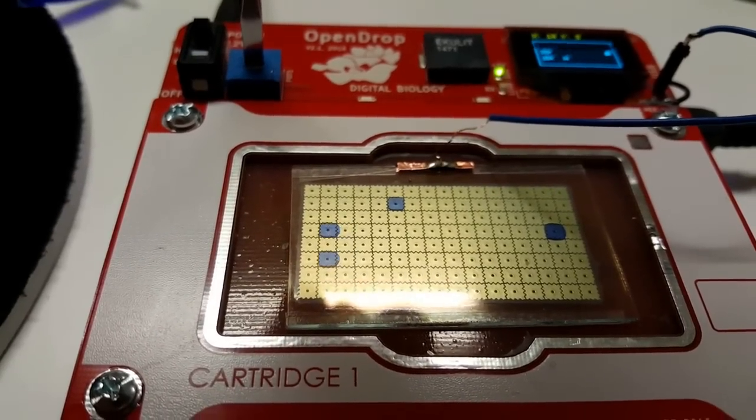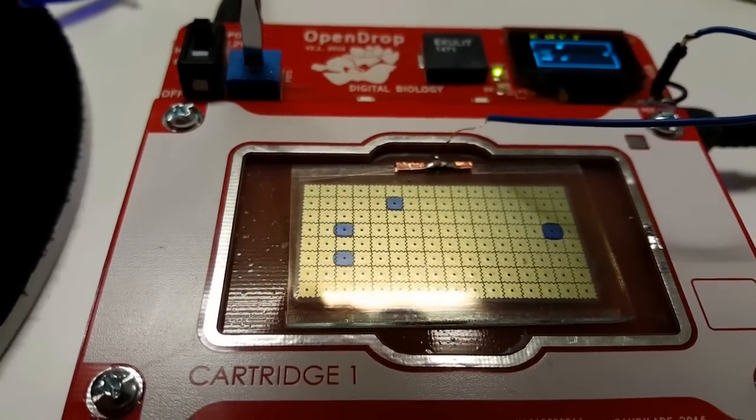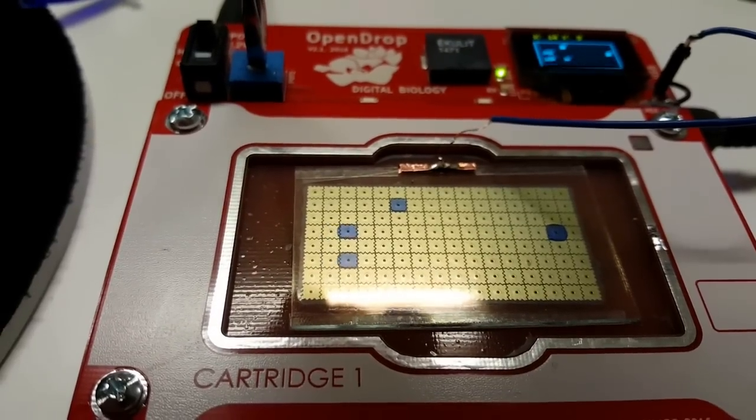As I turn up the voltage with the screwdriver, as you can see on the top left, the speed of the droplet is increasing.